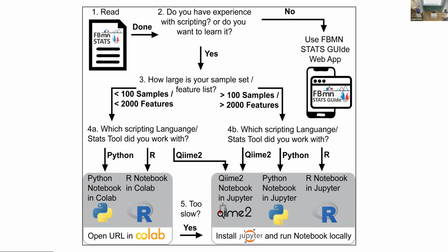If you're dealing with microbiome data, then you may have experience with QIIME 2. So then it might also be useful to use the QIIME 2 metabolomics plugins that we have, and use the notebook with QIIME 2. Although this is, I think, right now the most limited notebook.